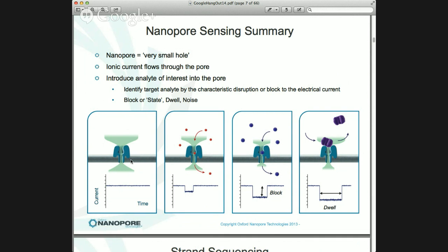And the membrane itself, typically, there's a membrane, and on each side of that membrane, not shown here, we have electrodes. And the electrodes apply potential, a bit like a car battery. But the ions can't flow to the electrodes because the membrane prevents that. It's what they call a giga-ohm seal. It's insulating. When you punch a hole in it, that hole becomes a channel through which ions can flow. And when those ions flow, the ASIC can detect a change in current caused by that ion flow, as shown here.